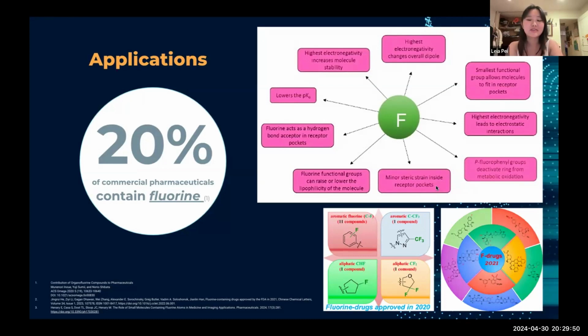Our machine learning alternative will provide a much less computationally intensive alternative when deducing compound structure. This will serve to also increase accessibility to a wider range of labs and individual researchers who have varying degrees of computational power available at their disposal, making structure determination much easier for scientists all across the globe.